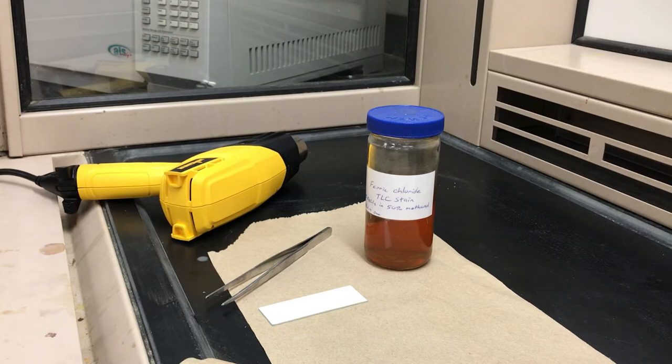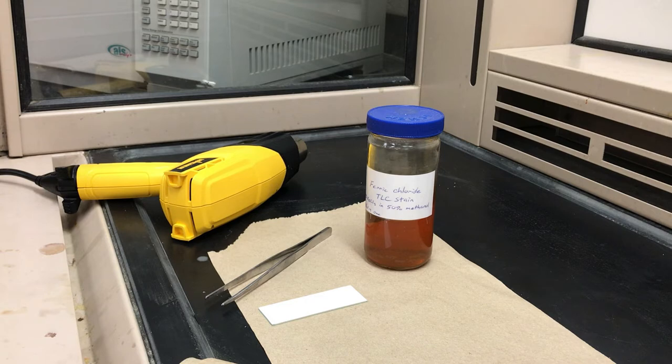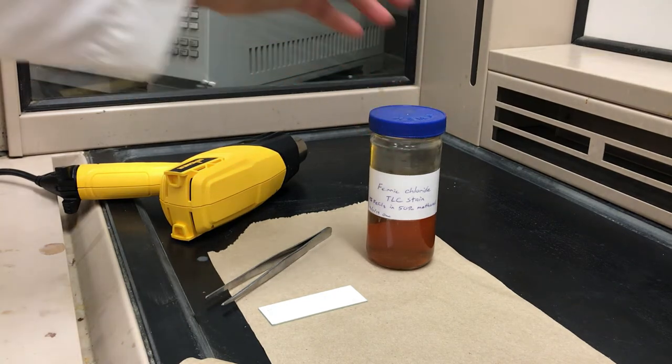Often using some sort of stain that is actually destructive to the compounds, you can only do this once. But sometimes you can visualize things better using these other methods. Iodine is pretty common - people will put the TLC plate into an iodine chamber and then the spots will eventually show up. But there's also a whole slew of different stains that you can use.